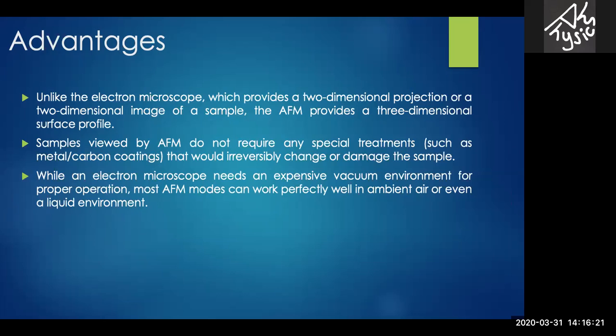This makes it possible to study biological macromolecules and even living organisms. In principle, AFM can provide higher resolution than scanning electron microscopy and other types of electron microscopies.